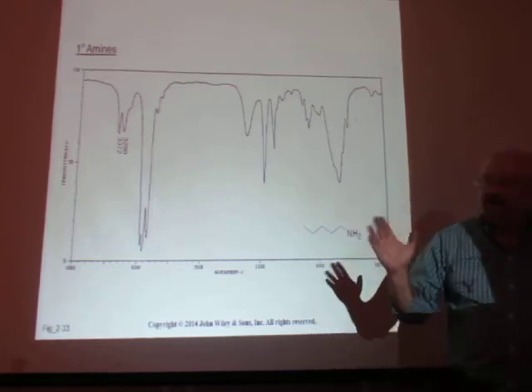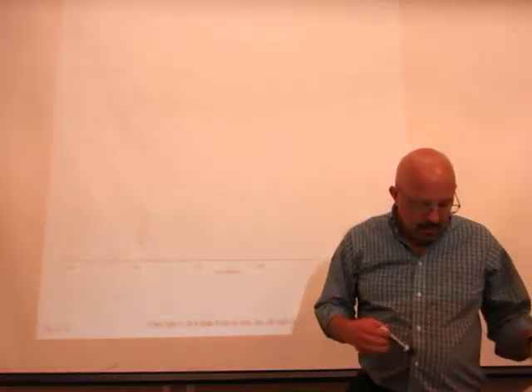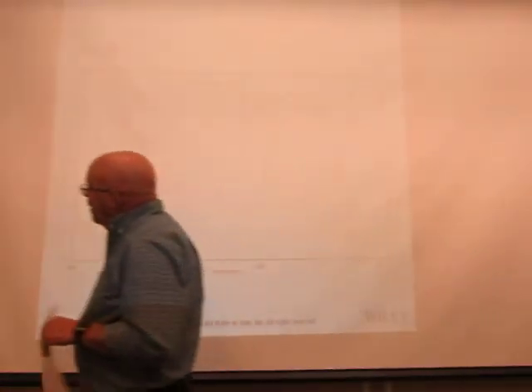Amines also have NHs. So if we look at the amine, instead of the amide, the amine shows an NH stretch at basically the same place. So 3,300 to 3,500 reciprocal centimeters.